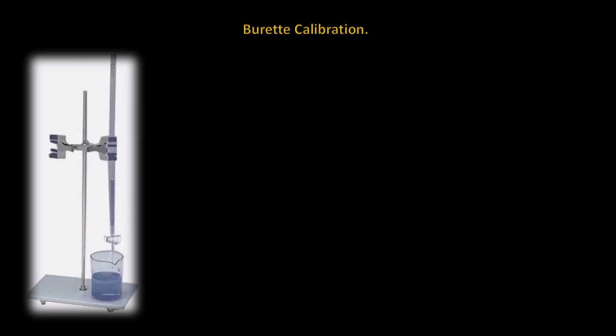The next few slides will demonstrate the calibration and the recording of the calibration. To start, there will be some items that are required, besides a burette, a clamp, and a stand.